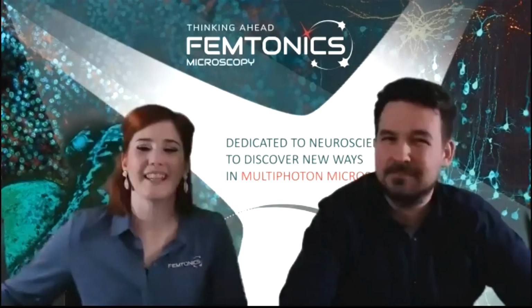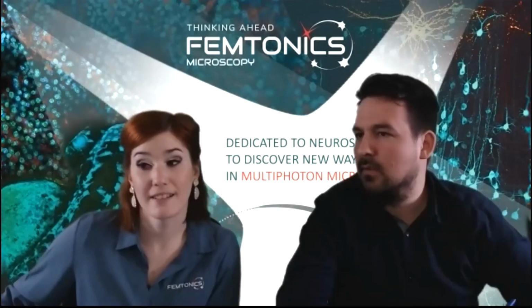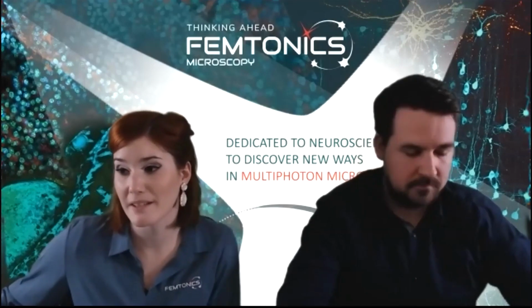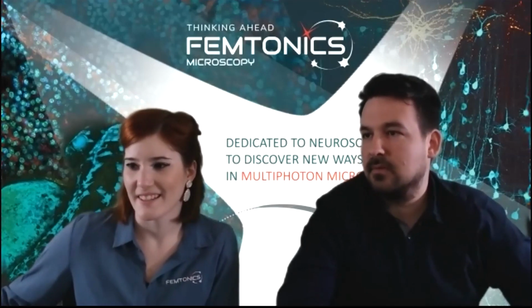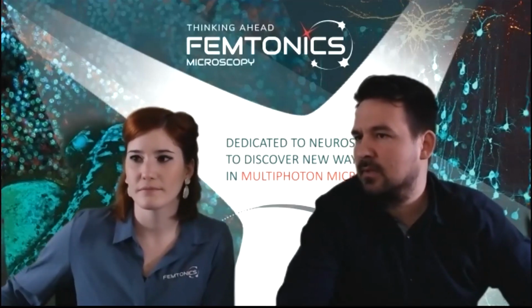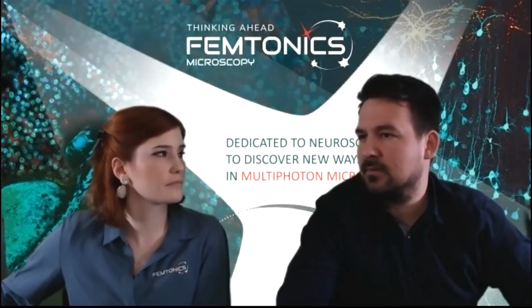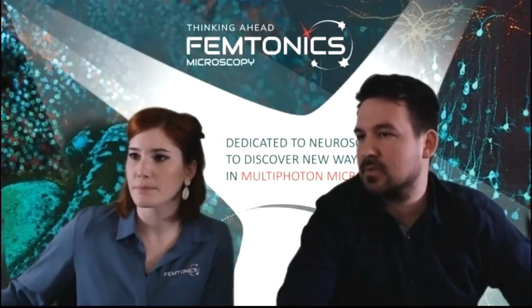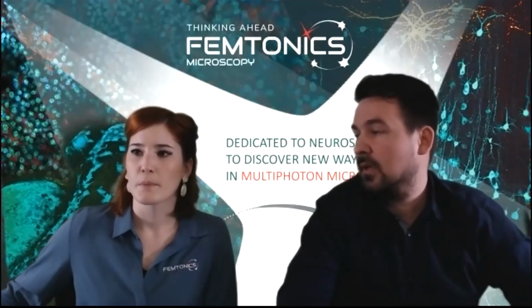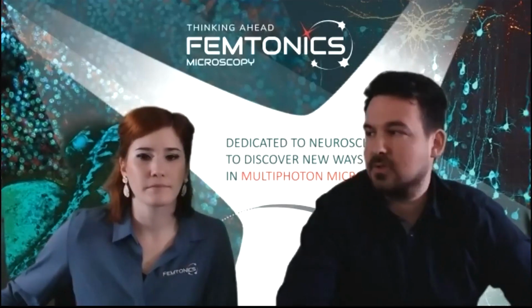Yes, the presentation will be available on YouTube. Nice. And another question there: is it possible to combine Titanium Sapphire laser for imaging and one-photon laser for uncaging on FEMTOSmart? Of course, yes. I think it was in the presentation as well.